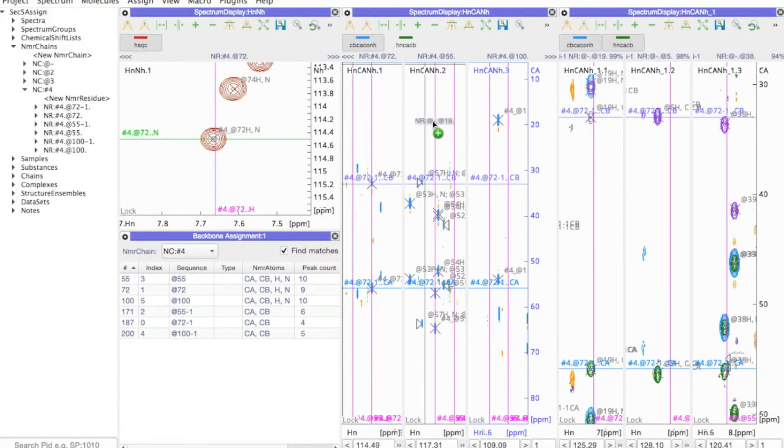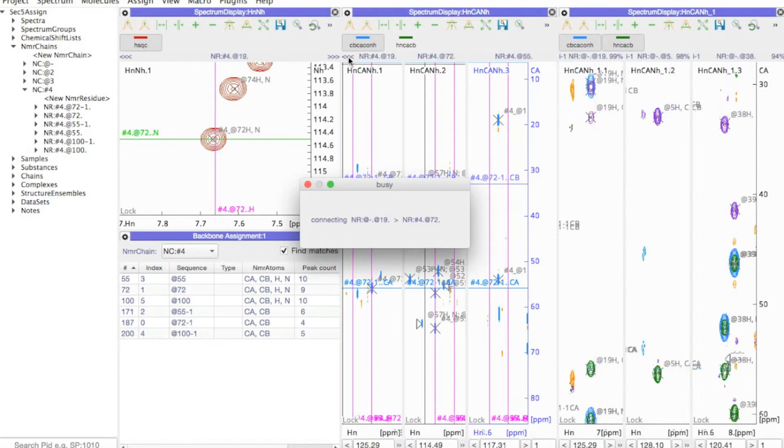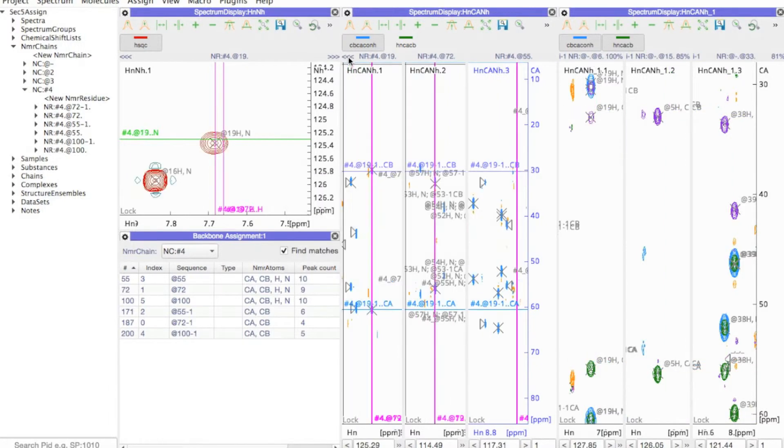If at any point I were to make a mistake, I could simply undo it, of course, using Control or Command Z.